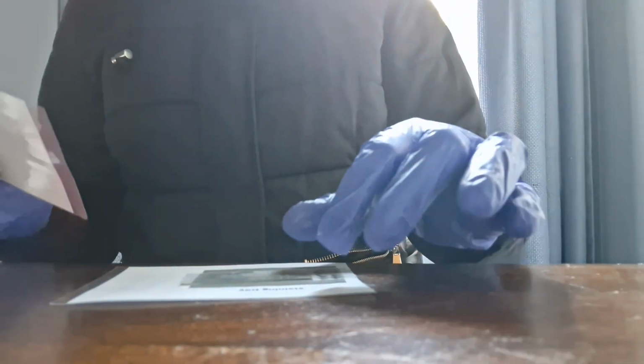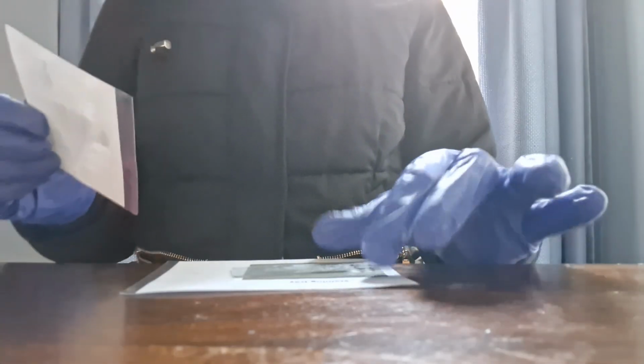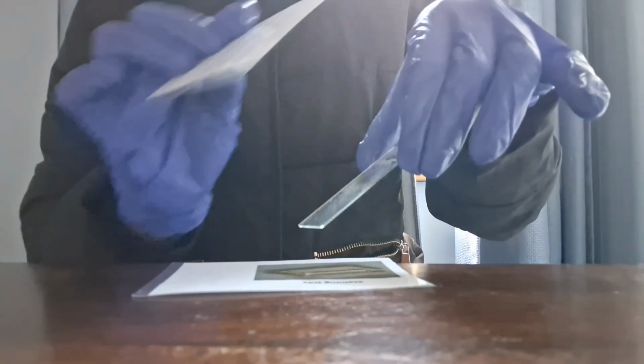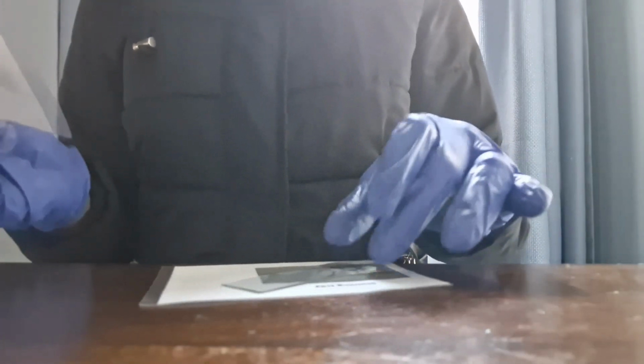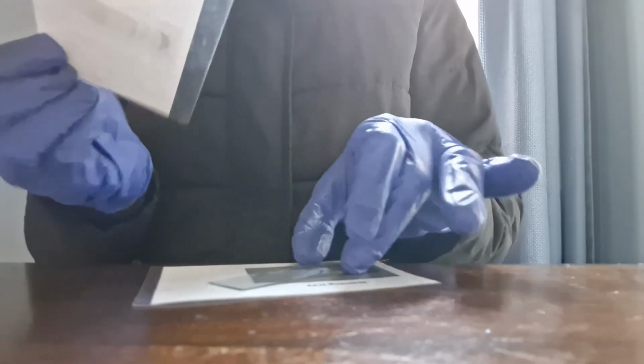After I'm done letting it sit, what I'll use now is the safranin. I'll put the safranin in here. The safranin turns the vegetative cells red, but it also provides contrast, so the green spores are easily seen.